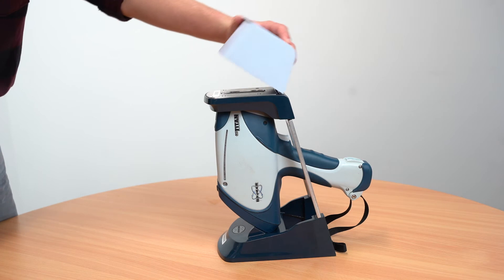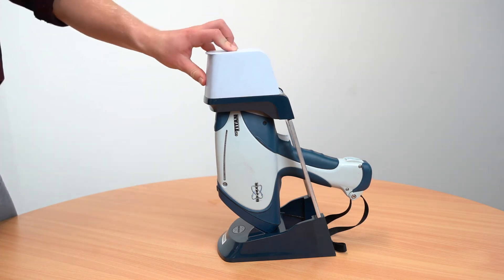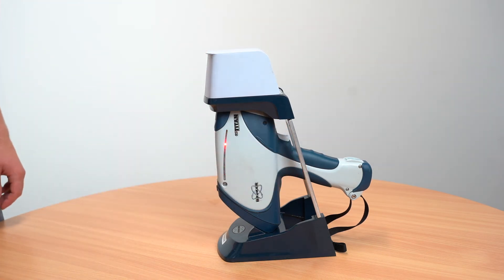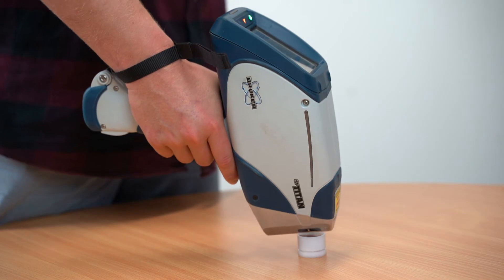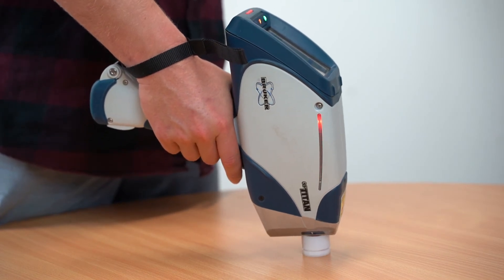When analysing pulp samples, for the most accurate results we encourage the use of a CRM cup. This is not always possible, so we will show you how to take an analysis with and without the cup. For the best results you want the window in direct contact with the cup. In the stand this is simple as you do not need to touch the cup during the analysis. Ensure that when you are taking an analysis the window stays in direct contact with the cup throughout the 60 seconds.